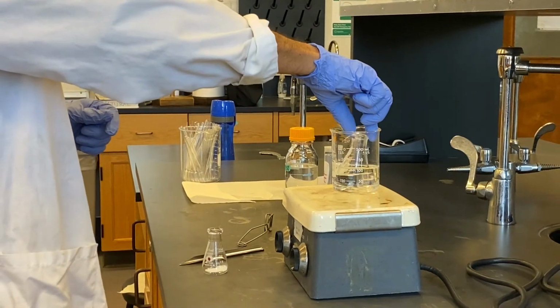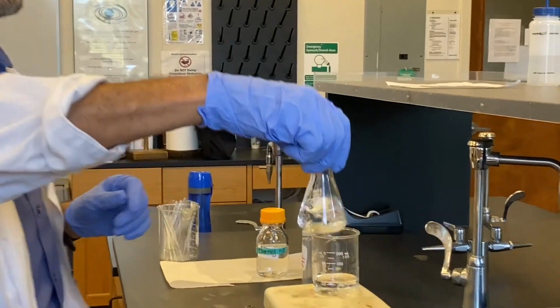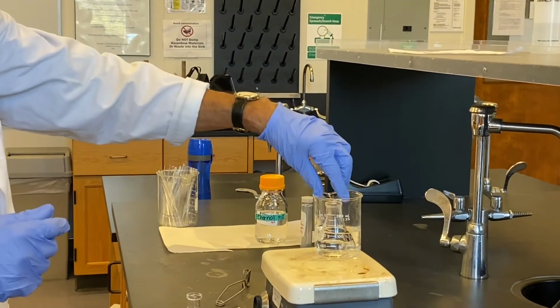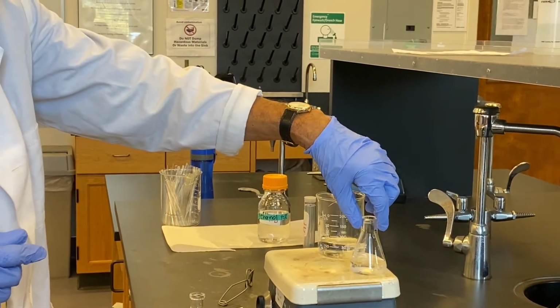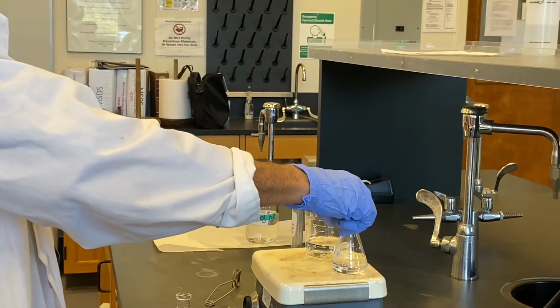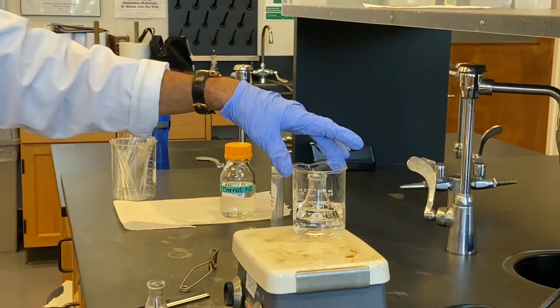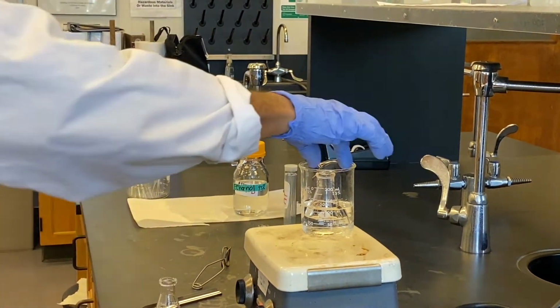Now, as I said, this is alcohol, ethyl alcohol. I have already taken alcohol in this reservoir. I'm boiling this in the water bath. This is my water bath, to boil the alcohol. The reason is, if I directly boil this here, you can do it, it's already a hot plate, right? The hot plate can go to a much higher temperature. You don't want that, as you have no control over how high it can go. I mean, you can regulate here, but still. If you have a water bath, water boils at 100 degrees, so it cannot go more than 100 degrees. Alcohol boils at 78 degrees, so it's perfect.